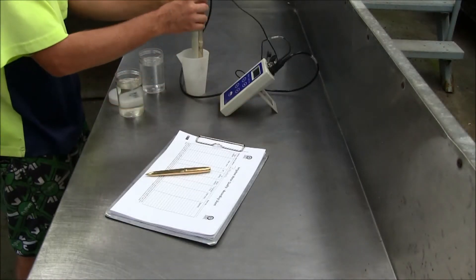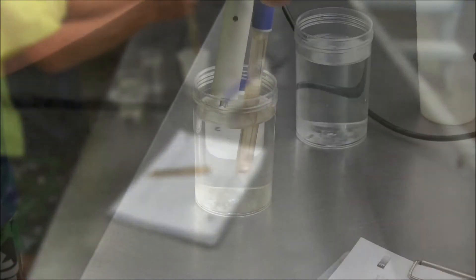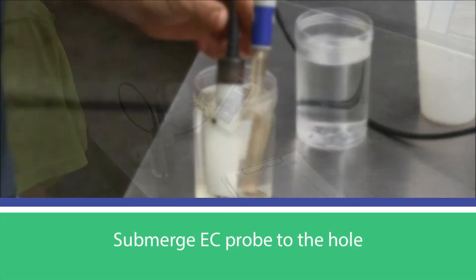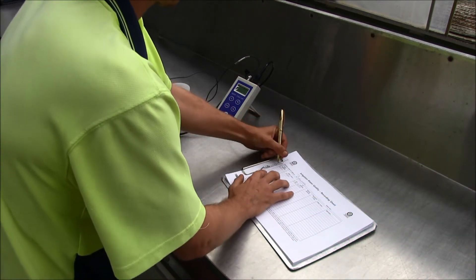Turn the meter on and shake excess water off the probes, then carefully place the pH and EC probes into the sample. Ensure the EC probe is submerged to the hole to get an accurate reading. Wait for the reading to stabilise, then record the result.